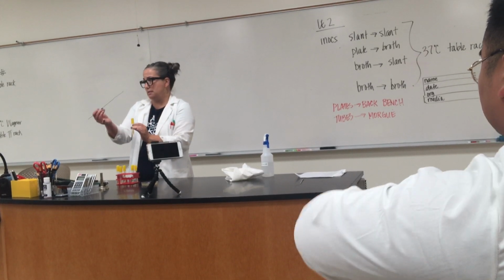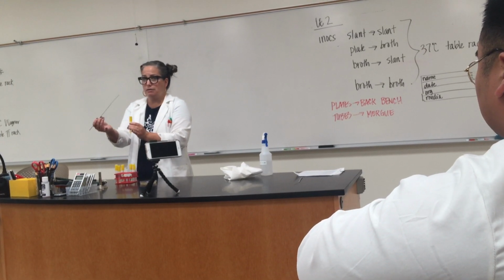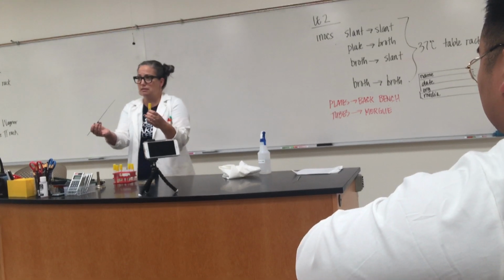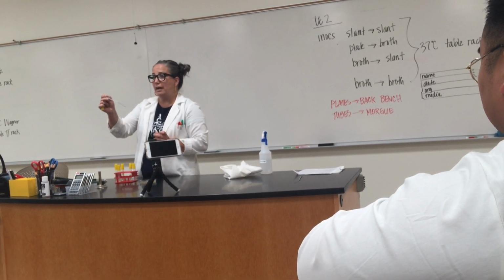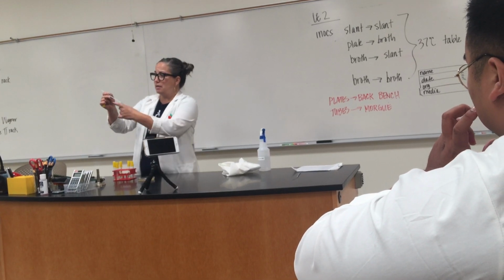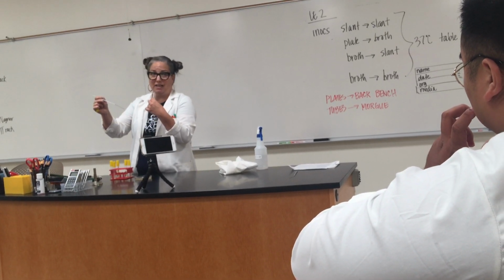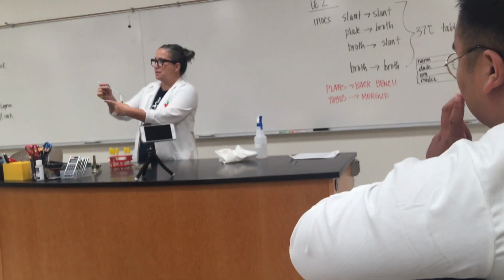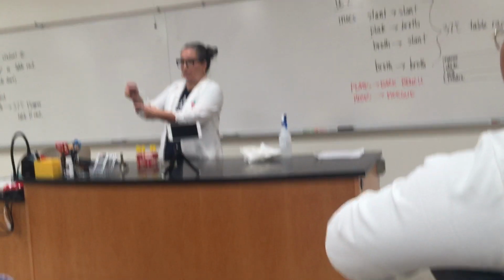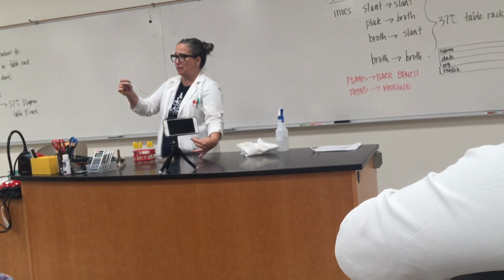You're going to take this, which I've called your dominant hand, which for statistically most Americans is your right hand. You're going to take your pinky and hold that in your hand the whole time. Now, you're not going to talk over it, that's going to contaminate it. But if this is facing down, nothing can fall in it. If I set it on the countertop, something can fall in it.